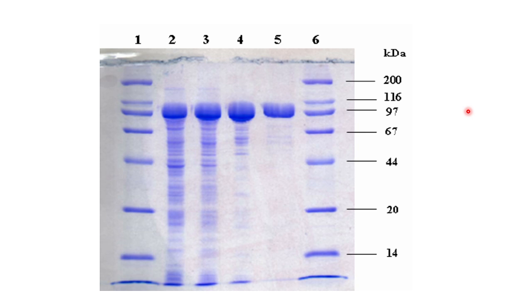Depending on the distance that it has traveled, you can tell the size. If the distance traveled is less over here, that means that it's of a higher molecular weight. Absolutely fine.